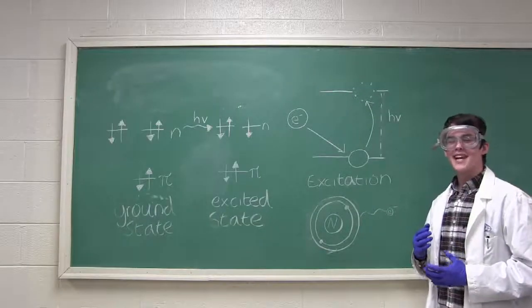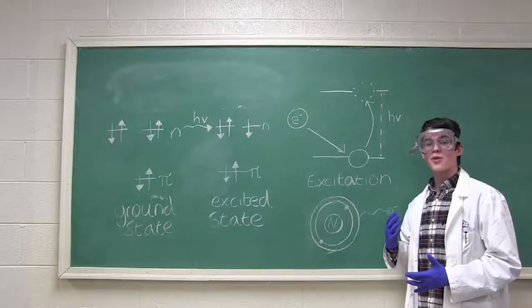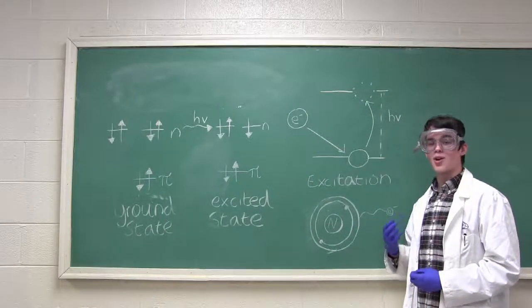Hi, I'm McCall, and we're about to show you a demo we like to call the flame test. Before we get started, Ben's going to show you all the science behind it. Hi, I'm Ben. I'm going to explain to you the science behind the flame test. So, in a moment, we're going to see some solutions over a Bunsen burner.